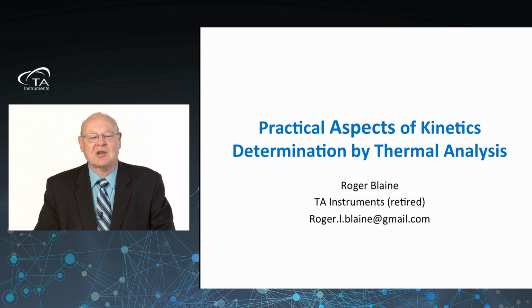The title of Roger's presentation today is Practical Aspects of the Kinetic Determination by Thermal Analysis. Roger? Thank you, Louis, and welcome to everyone. Today we're going to be talking about some of the practical aspects of the determination of kinetic parameters by thermal analysis, and in particular, thermal gravimetry and differential scanning calorimetry.